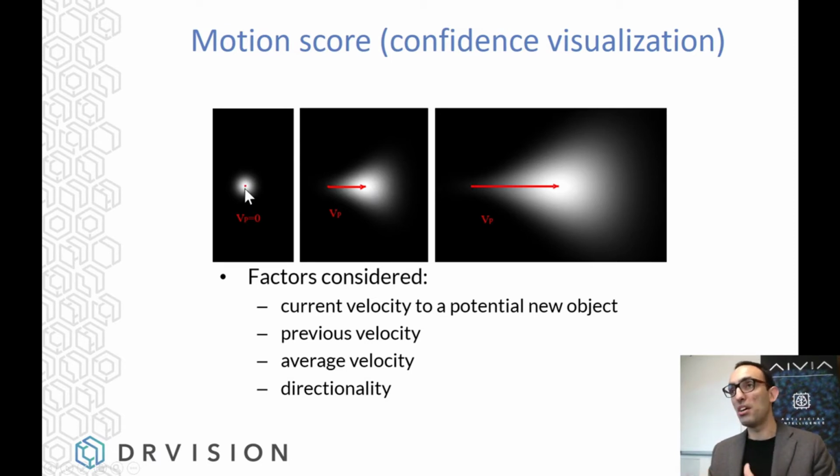We look within a certain range around the cell from time point 1 in time point 2. And if the cell is there, then we connect it up. And so our confidence is high if it's very near, and it's low if it's further away, of course, because the cells don't tend to move much out of the range that the user specifies. So this allows us to display a confidence map for that score, how that score would look like.